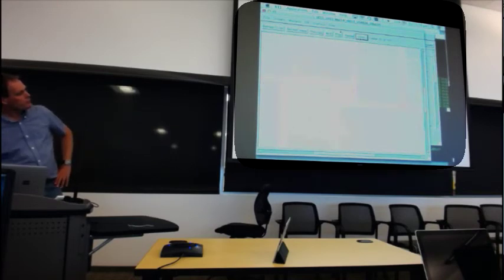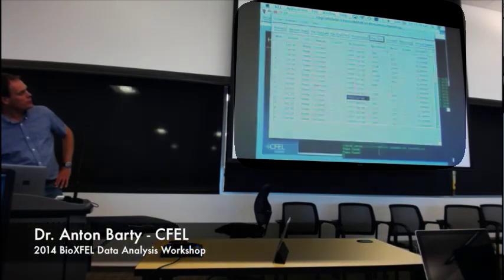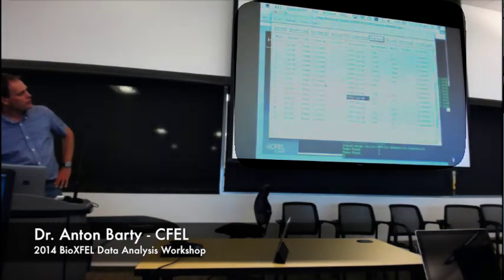Shuffle through the images. Evidently it's not doing a lot there for some reason. You can tweak the parameters that you should be putting back into the .ini file. It's good because it gives you instant-ish feedback on what your peak finding is.